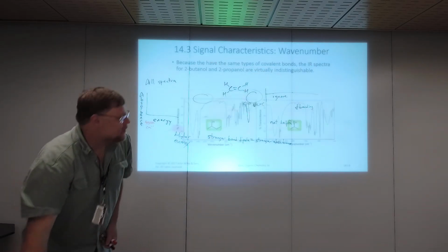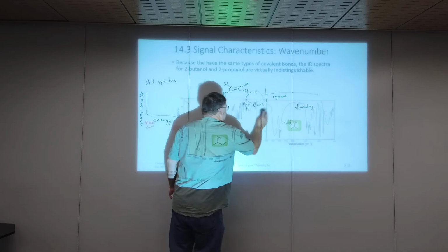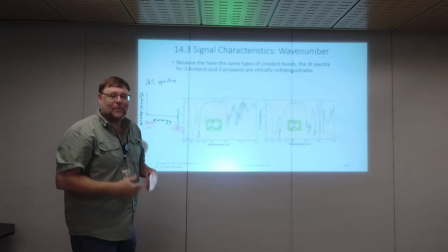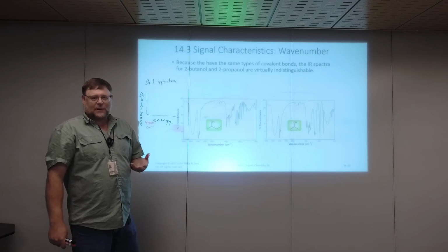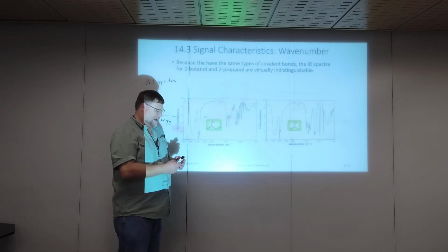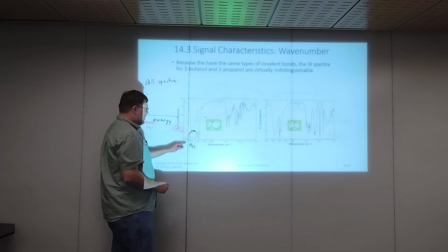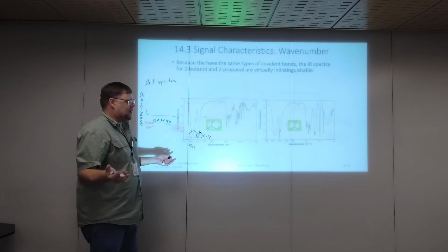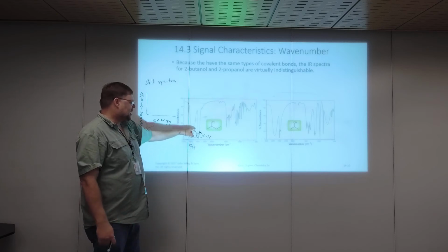However, the fingerprint region can be like, you guys have all seen CSI, right? So you kind of might have an idea what is meant by the fingerprint region. So here's two alcohols. Remember, I said that IR spectroscopy is supposed to tell you about functional groups. Both of these have an alcohol functional group. Might not surprise you that that is an OH. That's the OH stretch right there. These are CH stretches. Again, pretty much every organic molecule's got a CH stretch, so it doesn't tell you much. But OH tells you there's an alcohol there.